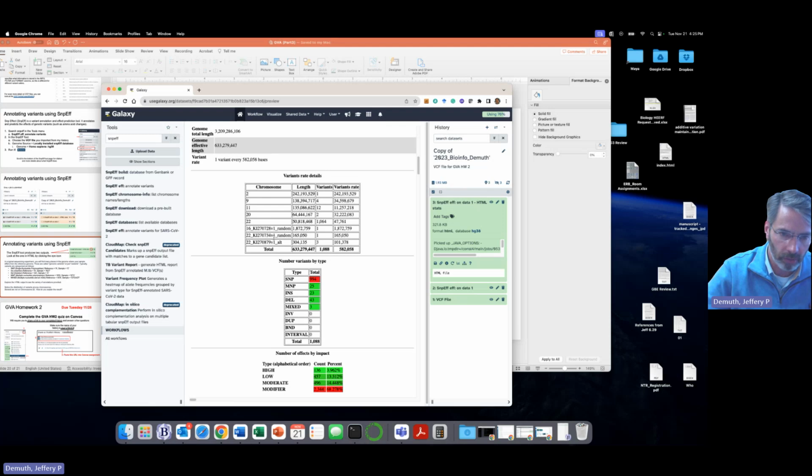Here you can see the rate across the genome. Remember, I mentioned this earlier, that this was a pull-down experiment for exons on chromosome 22, which is where most of the variants we found are, but clearly it was imperfect, right? Because we found variants on some of the other chromosomes. These other contigs are structural variations, things that are not in the canonical chromosome 22. That's what these two are. The duplications that are on chromosome 22.